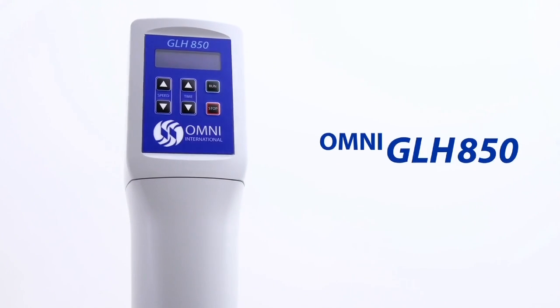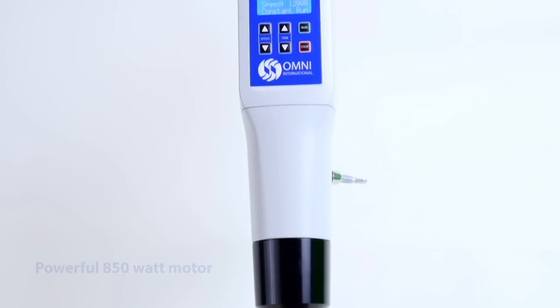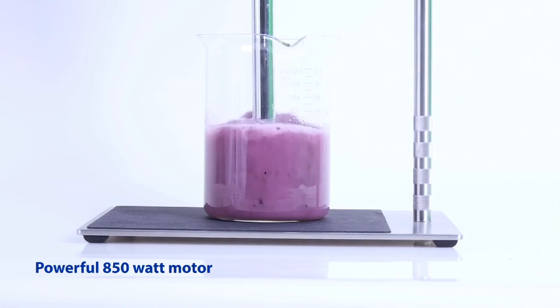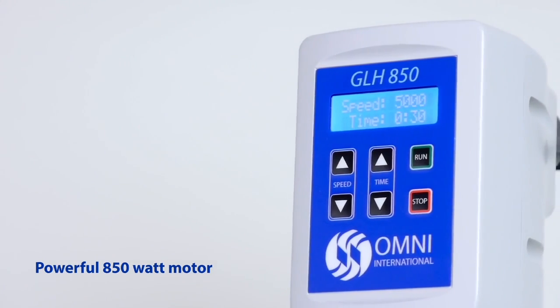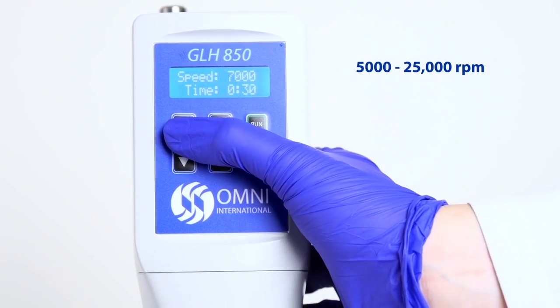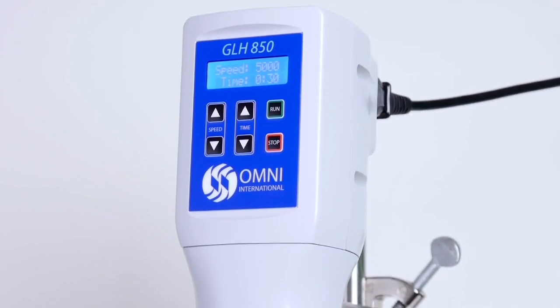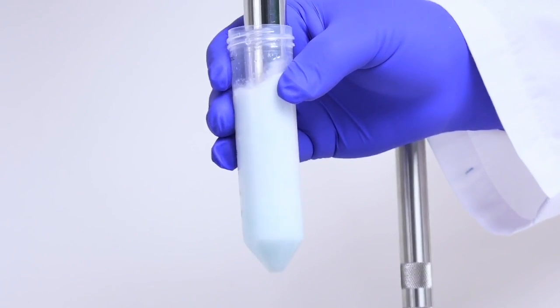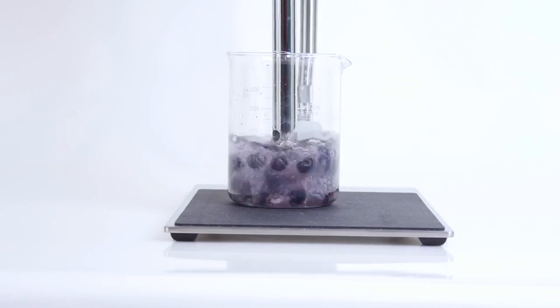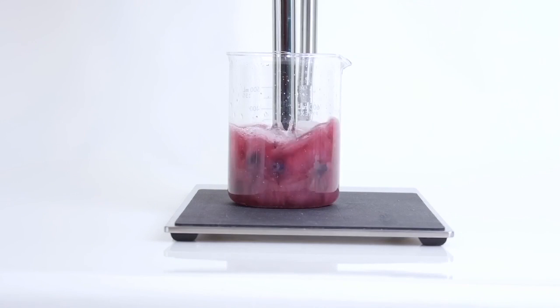The Omni GLH 850 offers the ultimate performance with a powerful 850-watt motor and digital speed controls ranging from 5,000 to 25,000 rpm. It is capable of processing at smaller lab-scale quantities or at larger production-scale quantities up to 10 liters in volume.